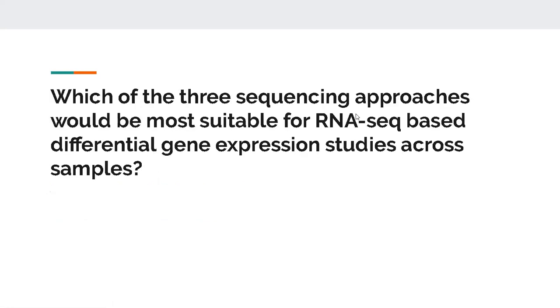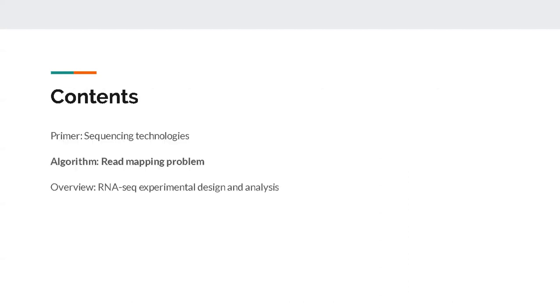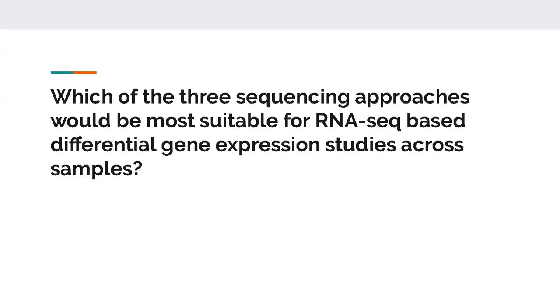So the question really is, which of these three sequencing approaches would be most suitable for RNA-seq based differential gene expression studies across samples, which we are going to talk about in the coming 2-3 lectures. So hold this question for now. We will come back to this at the end of this talk. Then probably we'll be able to say which of these three techniques is really most useful for gene expression based studies.